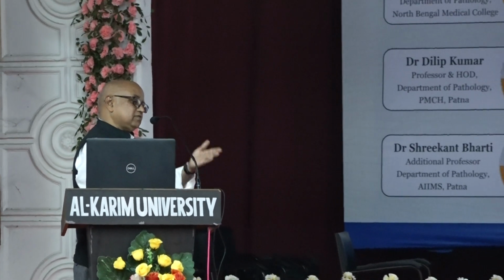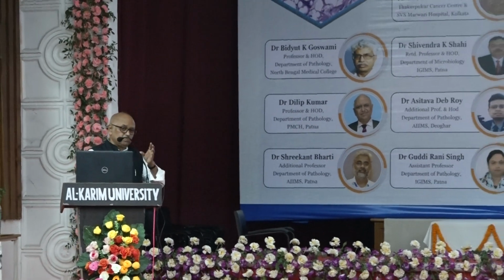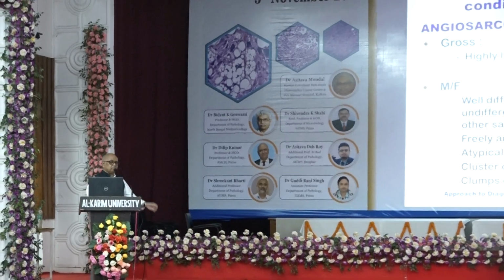It is grossly highly hemorrhagic. Yes, it is highly hemorrhagic. You have to fix the tissue for 2-3 days. You fix 2 days, then you take a section with a sharp blade, a new blade, so that it will cut a good section. Or take multiple sections.